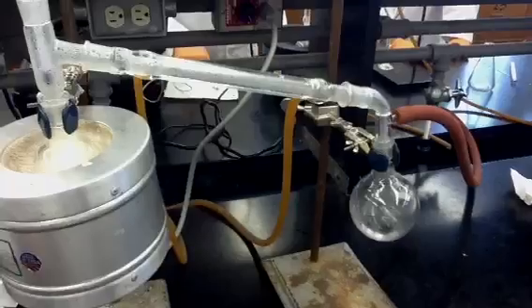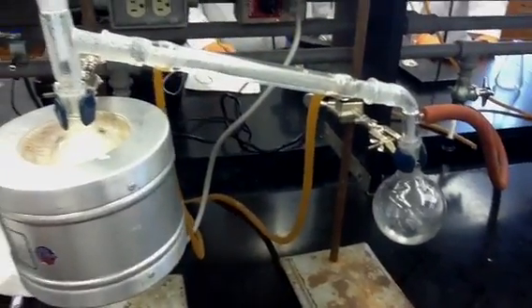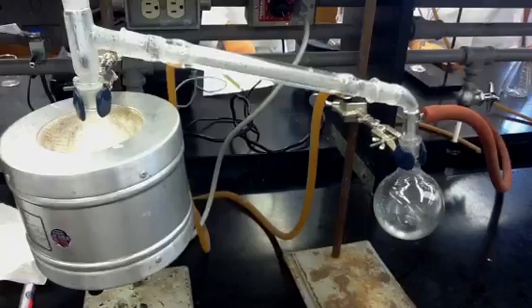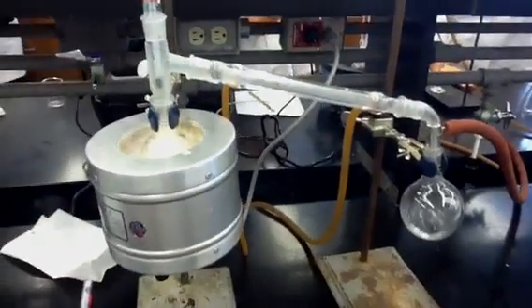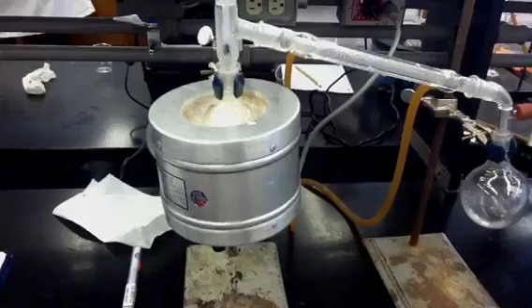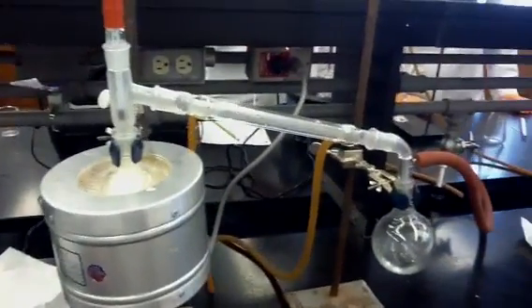Now we're just waiting for the experiment to stabilize itself. We'll record our final temperature and be completed with the experiment. When you're done, the first thing you want to do is turn off the heat and unplug the heating apparatus. Allow everything to cool off first, and then start taking everything apart.